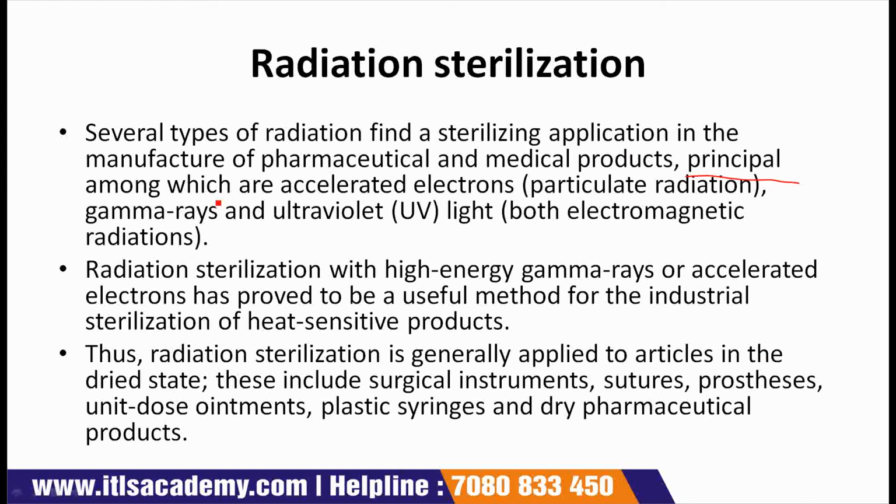Principal among which are accelerated electrons, particulate radiation, gamma rays, and ultraviolet light. And these both are electromagnetic radiations.